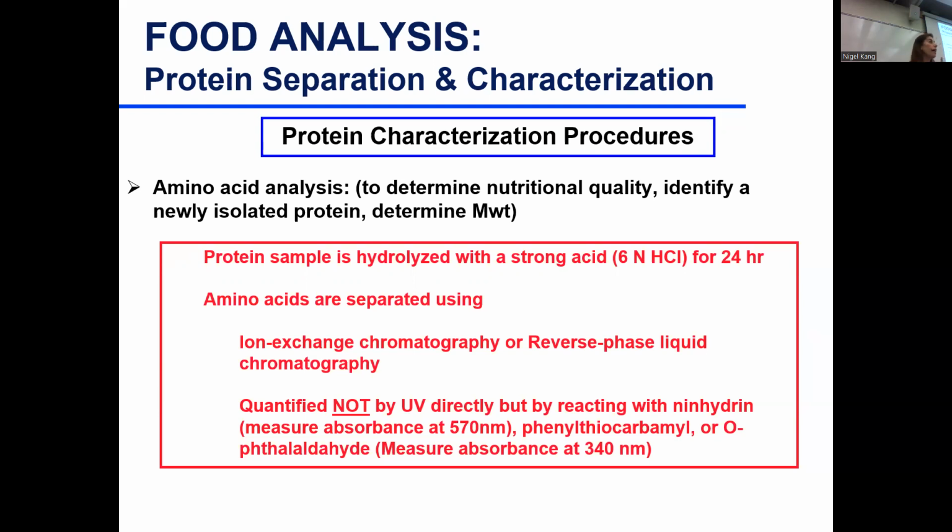The reason that acid digestion is not good for tryptophan, methionine, and cysteine is that they get destroyed under acidic digestion conditions. So we use 6 molar HCl, and we put our sample in an oven at about 110 degrees Celsius for 20 to 30 hours. Usually 20 to 24 hours is recommended.